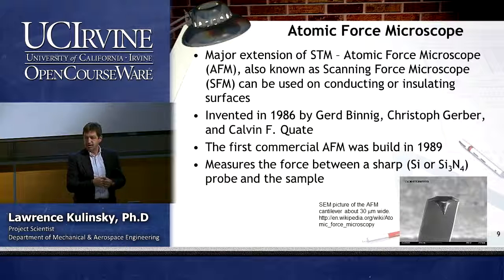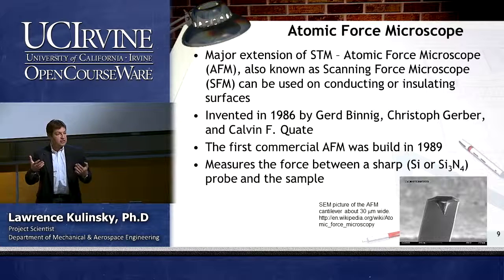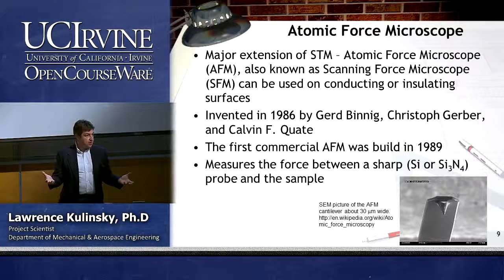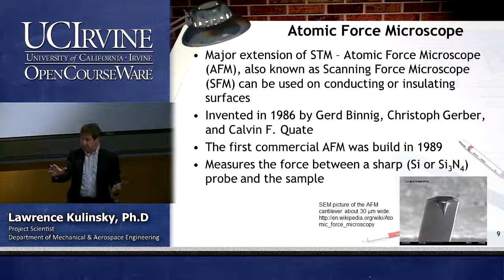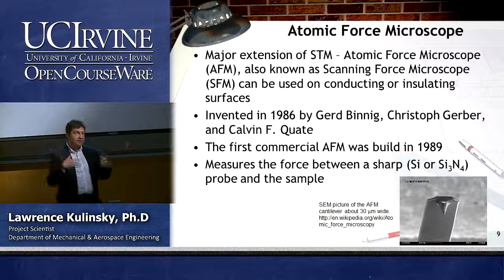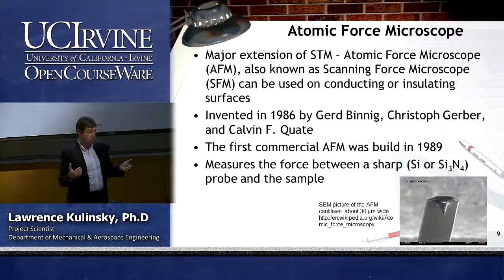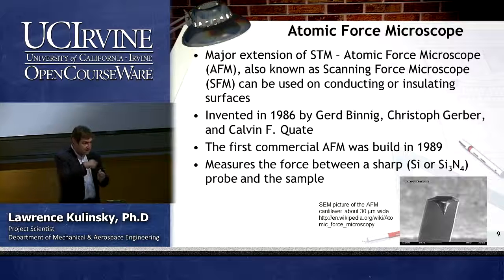Absorption? Well, it's not a force, right? But do you know, let's say, capillary forces? Let's say van der Waals, there are many different forces. Typically what happens is you have a very sharp tip and you have a surface. So you actually have a monolayer of fluid, typically condensed on your surfaces. So what the tip measures, and people are actually kind of confused about what forces are there.